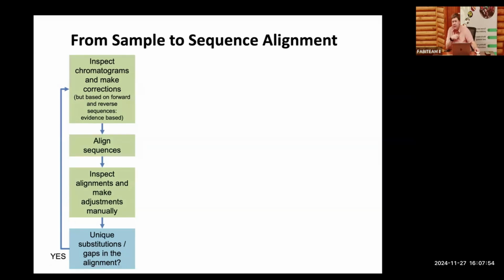I would recommend personally to go back to your sequence, to look at your sequence alignments. If there are stretches that you can see are obvious problems or mistakes, because these software do make mistakes, and I will show you that, then you can just adjust it in whatever sequence alignment editor you use. These editors are things like BioEdit. That's a very popular software for Windows. For Mac, it can be SeaView, but there's a whole body of sequence viewers, and I'm talking about DNA sequence or amino acid sequence viewers.